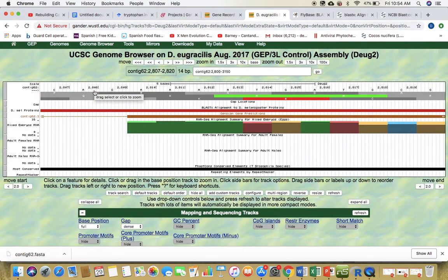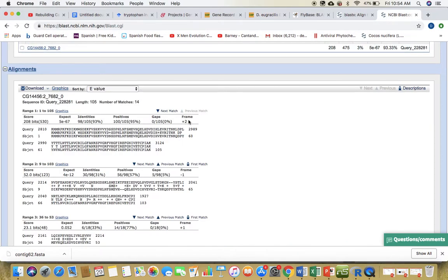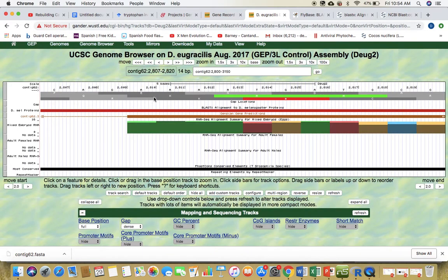So this AG site here, remember, for exon 2, we're looking at frame 2 for this alignment. Our AG site is here, and it ends here. We're looking to the right. A while ago, we looked to the left of the splice site donor. Now we're looking to the right of the splice site acceptor, AG, on our positive strand.